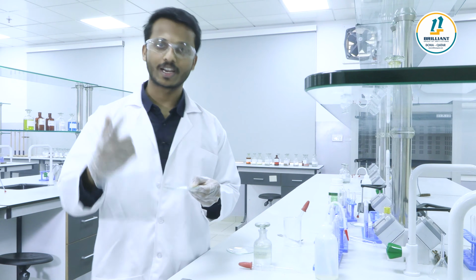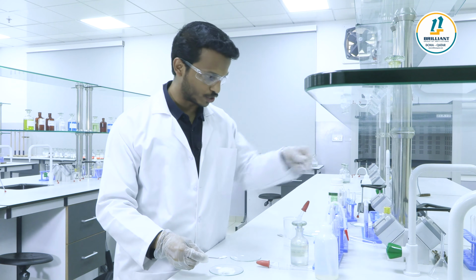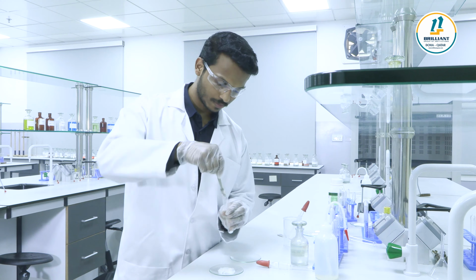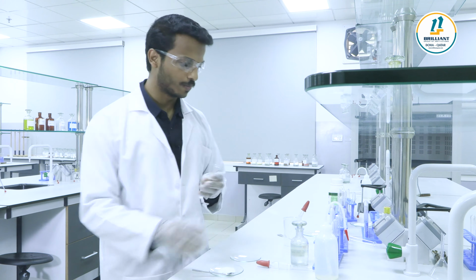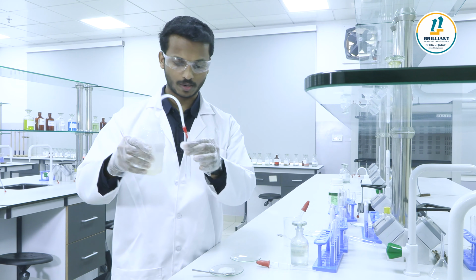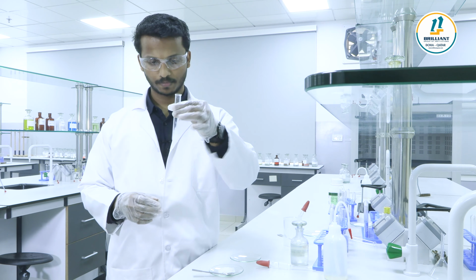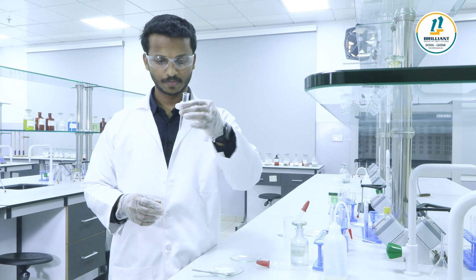Now let's go for the confirmatory test. Take a pinch of salt into a test tube and make it a solution by adding some water. Maximum try to dissolve it.